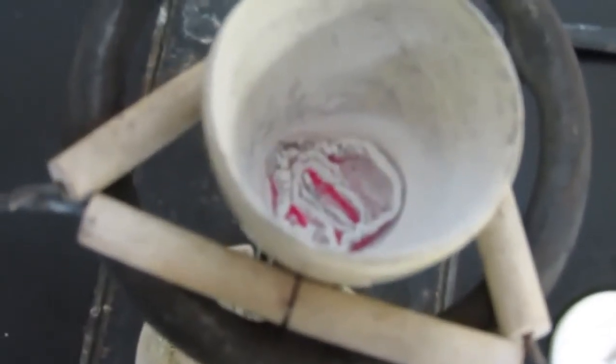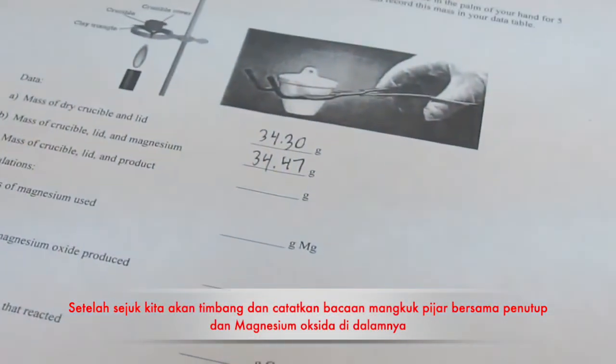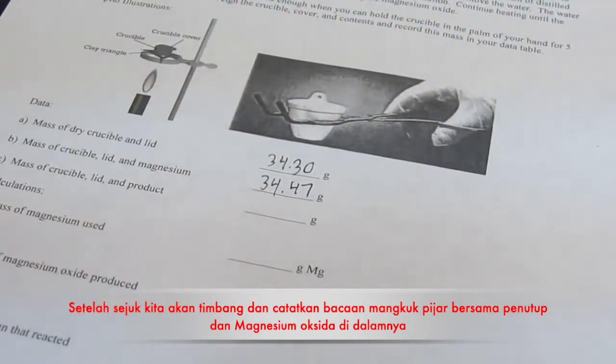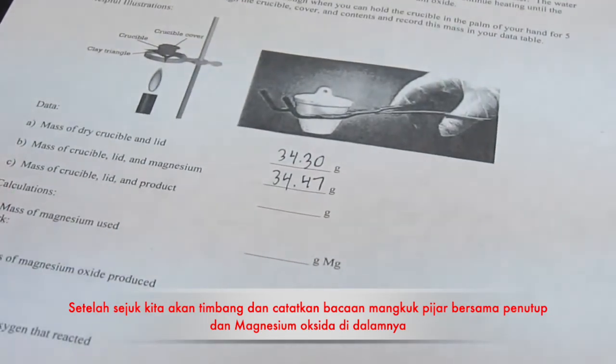Okay, you can see the bottom of the crucible is still glowing red. We'll allow it to cool. And we will find the mass of the crucible, lid and our product finally. We can do that after the reaction's over and it's cool. We'll never weigh anything hot.